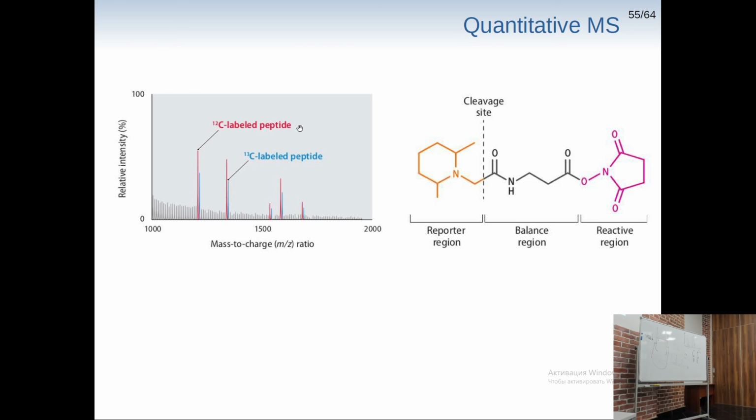Can we use this approach for, let's say, animals or plants? Of course, we don't need to feed them with heavy isotopes. Actually, there are no heavy isotopes here, so it can even be bought without any problems, because for some reason our companies will not sell us even stable isotopes. They are afraid that it's something nuclear and so on. I don't know why, because we have a lot of stable isotopes around us, but still, this thing can be bought without any problem.